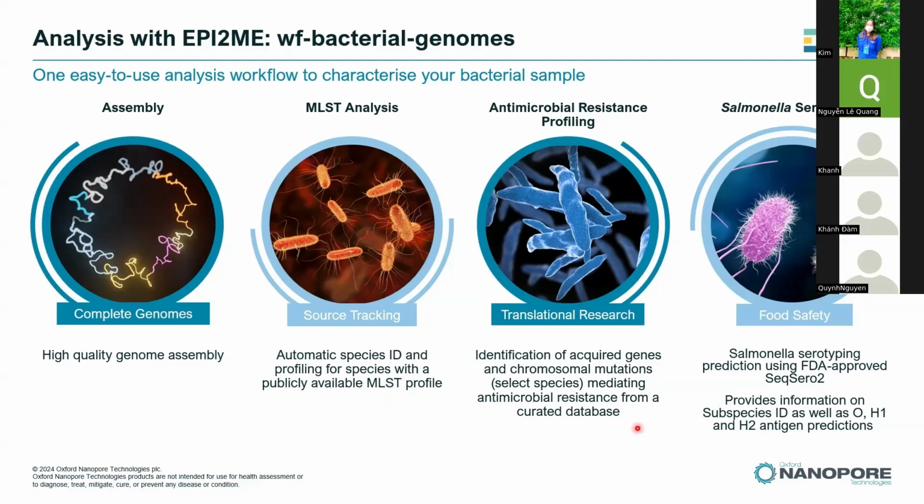And here, this one is the antimicrobial resistance profiling. So this workflow also allows the identification of both acquired resistance genes as well as chromosomal mutations that mediate AMR.